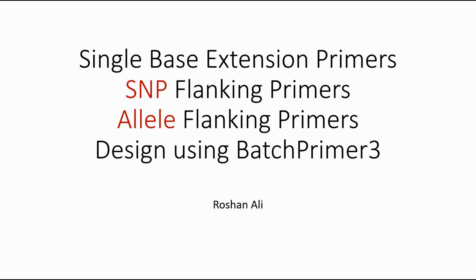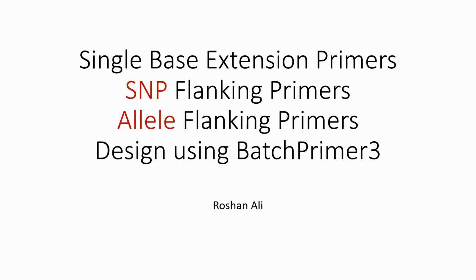Friends, our today's video is about single base extension primers as well as SNP flanking or allele flanking primers designing. And we will use BatchPrimer3 server for this purpose. Okay, let's begin.